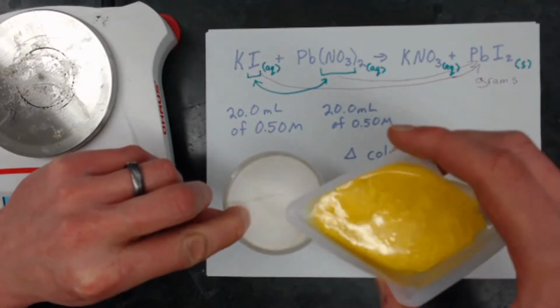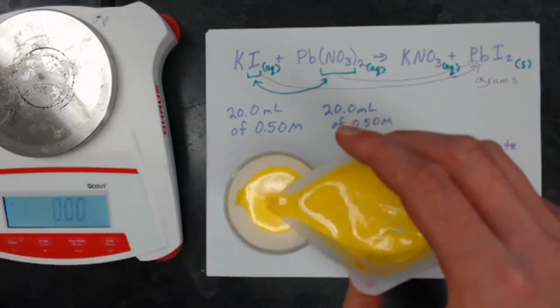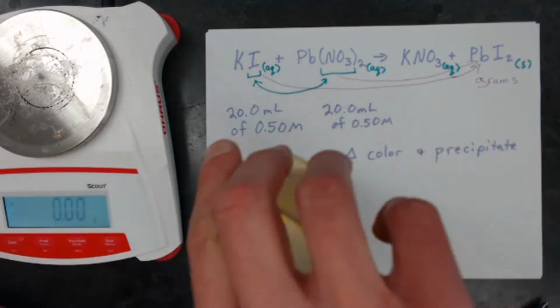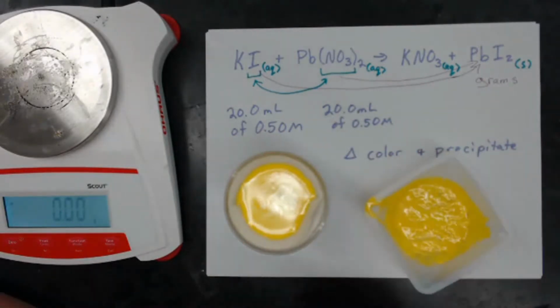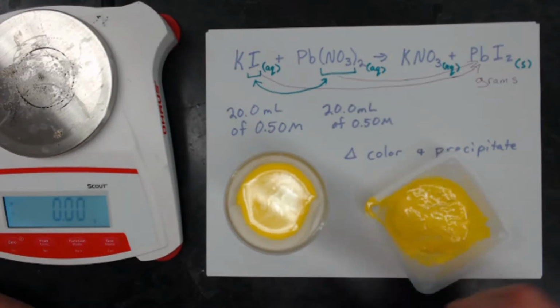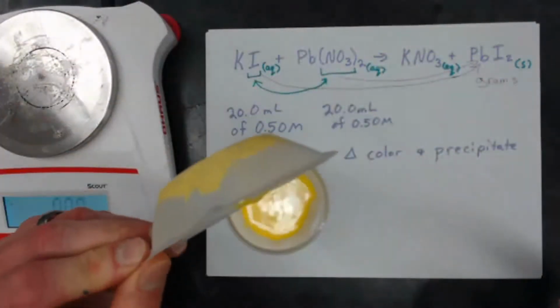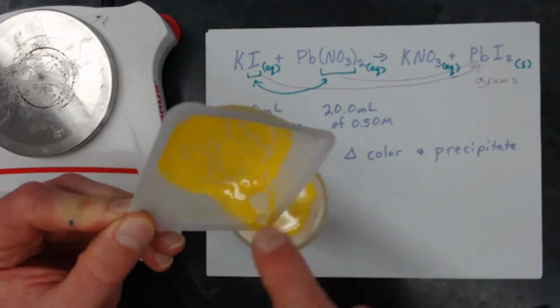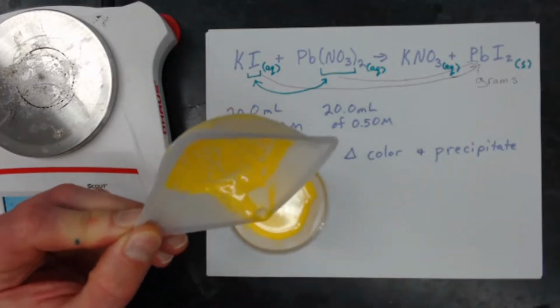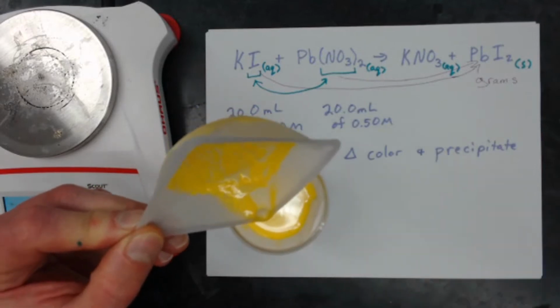I'm going to try to transfer this little bit of awesome into here. And what will happen? Yeah, over the course of the next few minutes, all the water is going to drain out into the bottom of the cup, and it's just going to leave the solid up here. Now, if I was back there in the lab, I can't do it very well here, and I don't want to spray my computer, but I'd also be spraying this with some distilled water, trying to wash as much of that down into this little filter as I can to get the highest percent yield I possibly could.